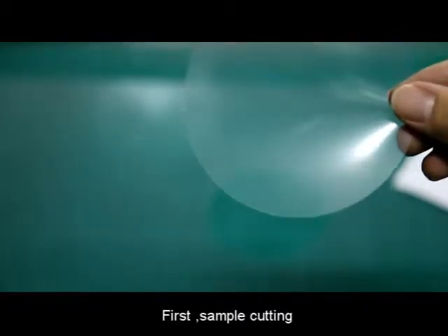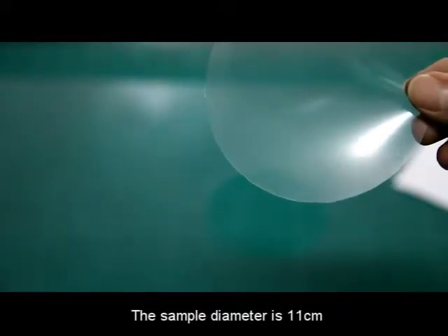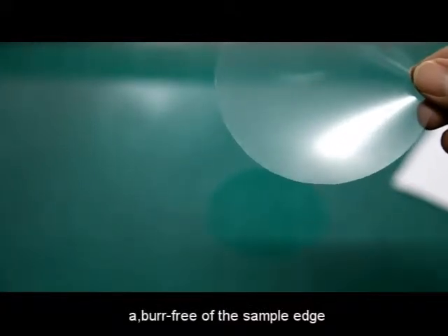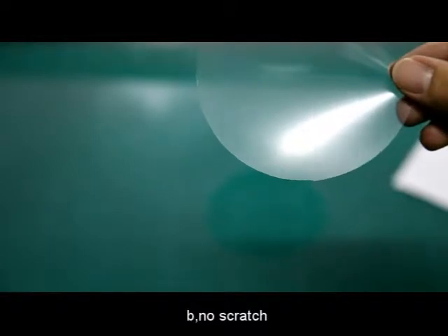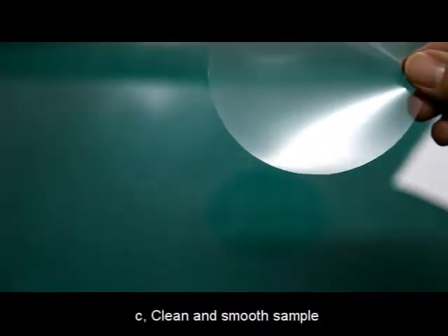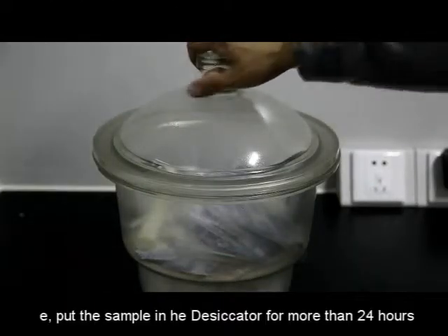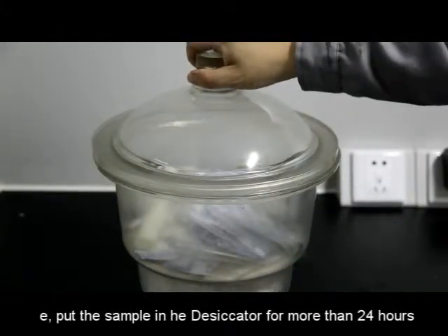First, sample cutting. The sample diameter is 11 cm. Requirements: A — no burrs on the sample edge; B — no scratches; C — clean and smooth sample; D — not allowed to touch the sample; E — put the sample in the desiccator for more than 24 hours.